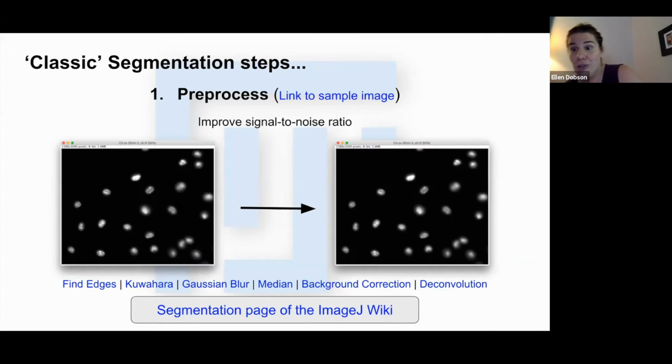As you guys know, acquisition devices are not perfect and they can introduce a lot of noise and artifacts, uneven illumination and such. Typically the noise we see in images is shot noise that originates from electronics during acquisition. It results in a non-zero background. So this is something we also want to correct for.